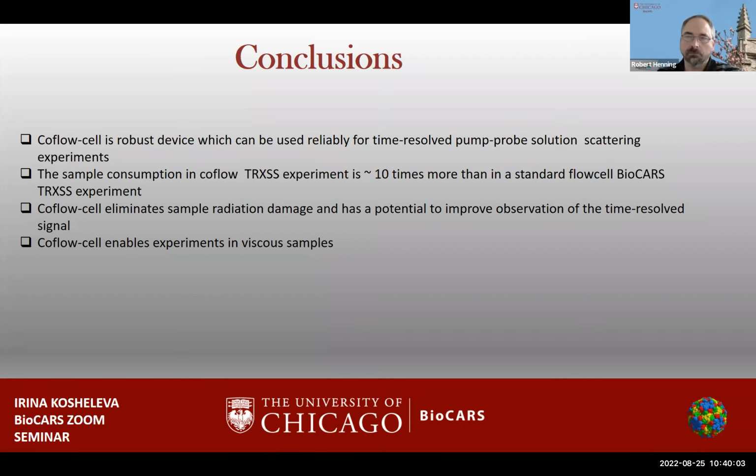In the horizontal orientation, we can go maybe 5, mostly 10 milligram per milliliter. I did experiments with dye for these pilot experiments, and therefore for the PYP we use the vertical orientation, when the gravity is in line with the flow, and in this orientation it works very well and quite stable.